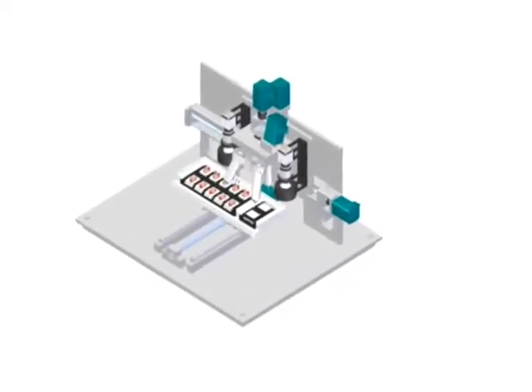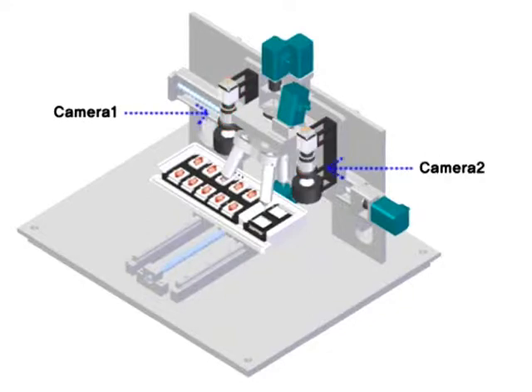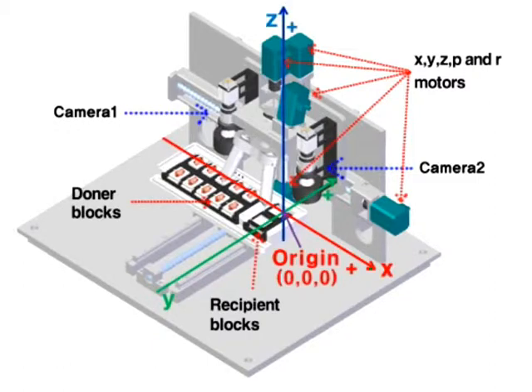Setup indicates the setting of the physical positions of the 2 vision recognition cameras, 5-axis motion controller, starting point sensor, donor block, recipient block module, and each component, and the setting of the constants and variables that affect the camera image processing.